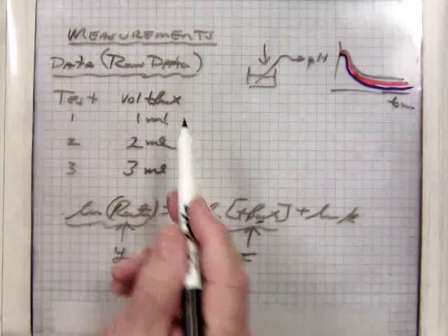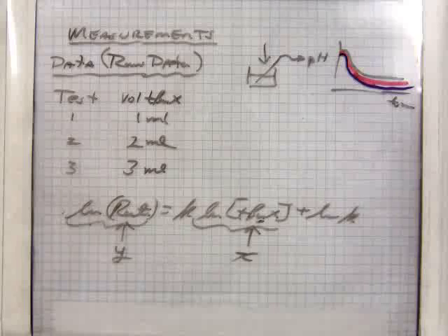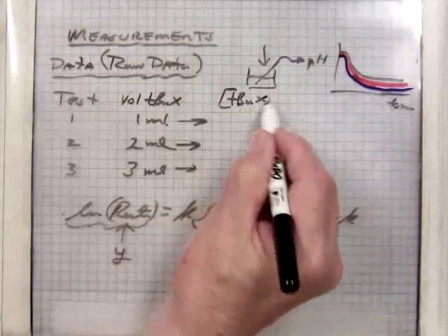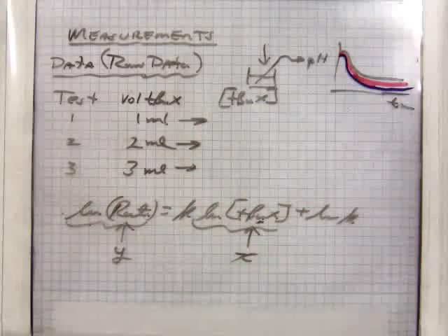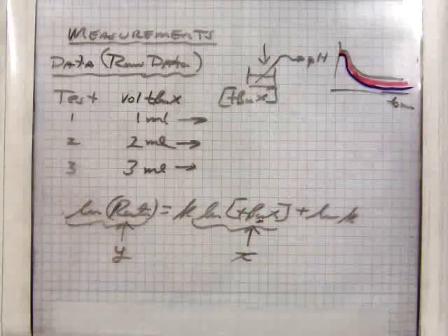From this 1 mil, you'll be given the density of the T-butyl chloride. And then you get grams. You can then convert grams to moles. And you'll have that many moles of T-butyl halide in so much volume, moles per liter. So you'll have a concentration. And so this will give you the concentrations of T-butyl halide in moles per liter. Based on the density, you convert volume to mass. Density times volume, grams per milliliter, gives you grams, and then you convert grams to moles, and moles and how much you put in, the mix. If you put in 1 mil, that's going to be 51 mils. And so you have to divide by 0.051.